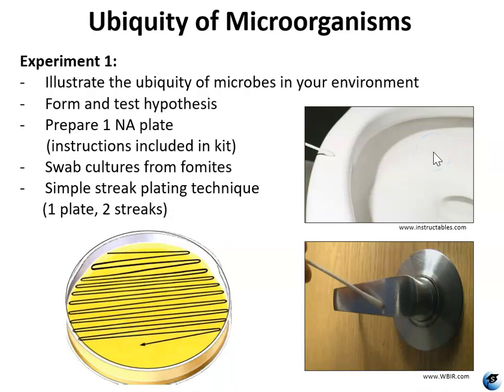Don't forget, when you're using these swabs, to roll the swab so you don't tear through the agar. You're going to tape the lid closed, just one little piece on one side and one on the other, just like we saw before in Lab 1.